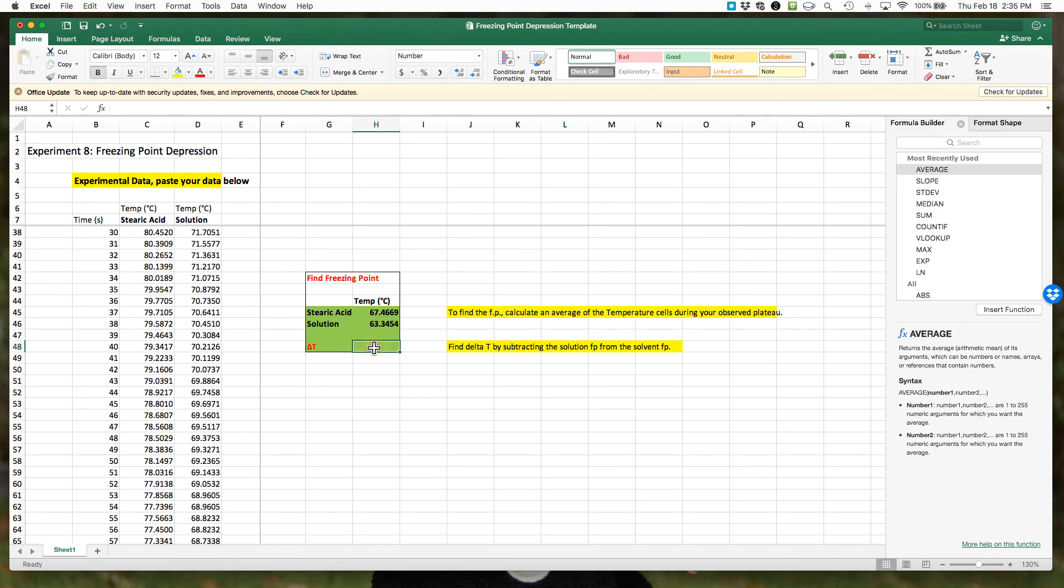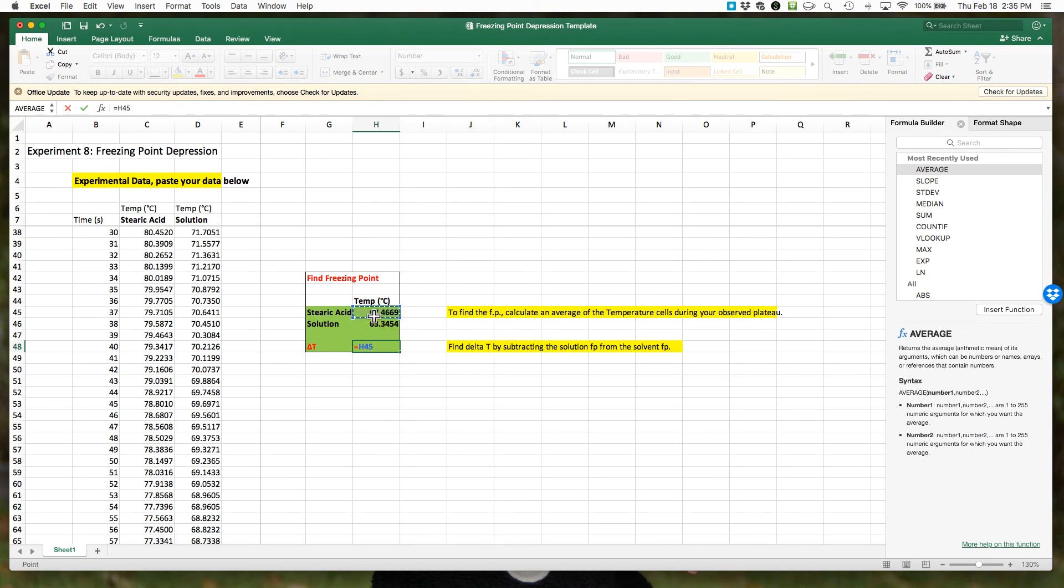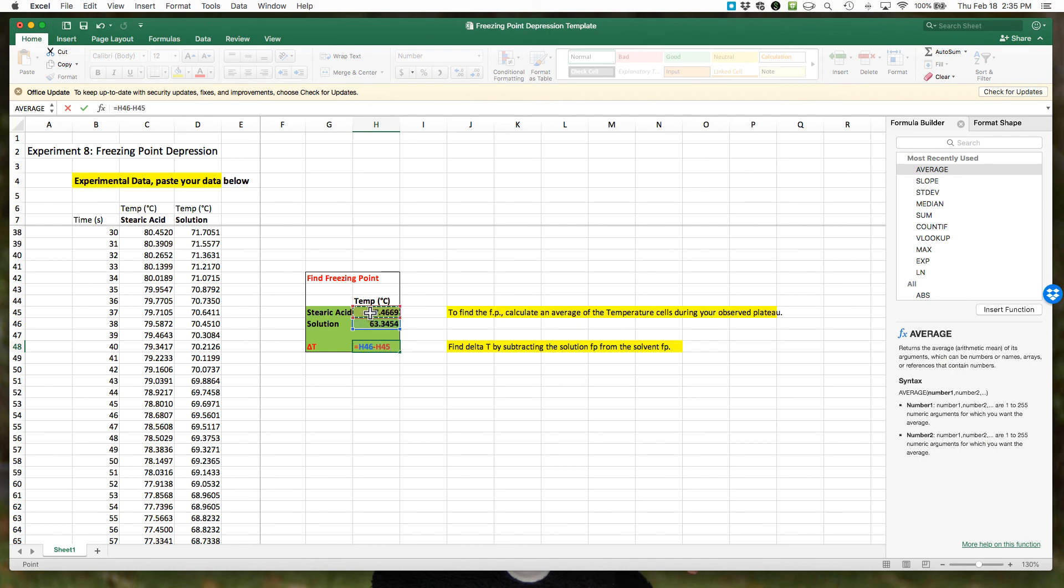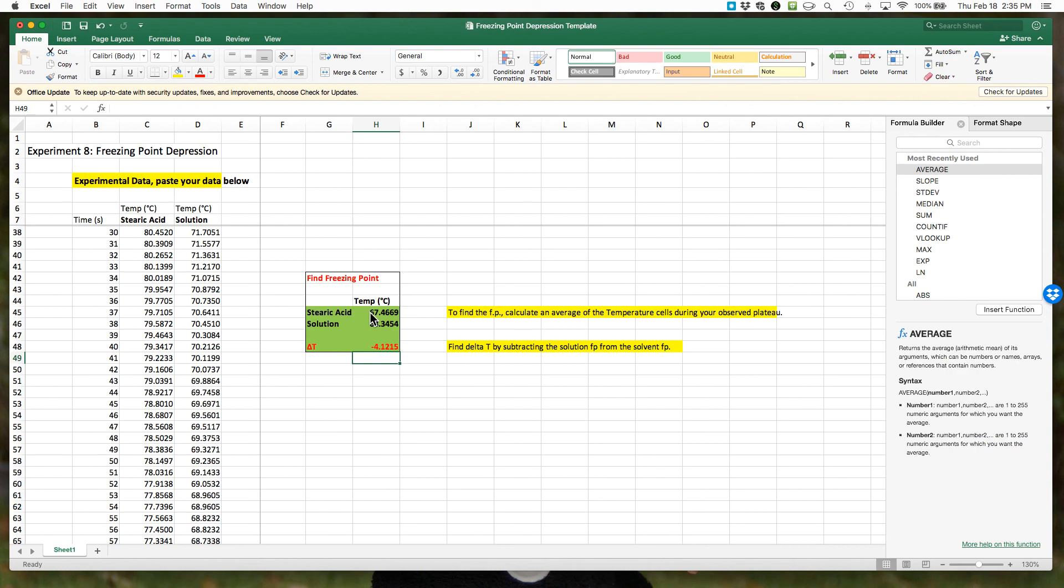We want to take the stearic acid. Oh, did that backwards, sorry. We want to take the solution and we want to subtract the solvent. We get negative 4.12 degrees Celsius. We're always doing the solution minus the solvent because it's final minus initial, and here's your delta t. Thank you.